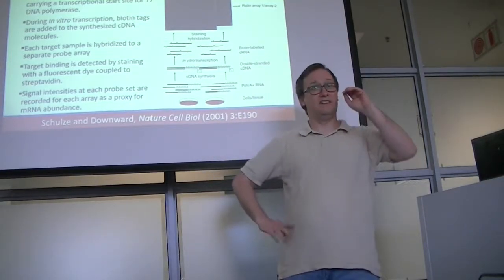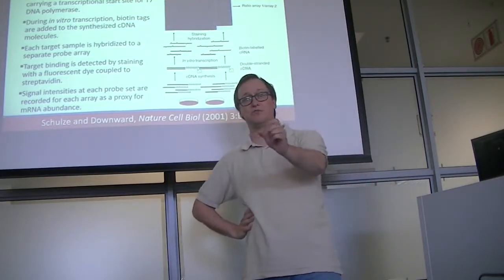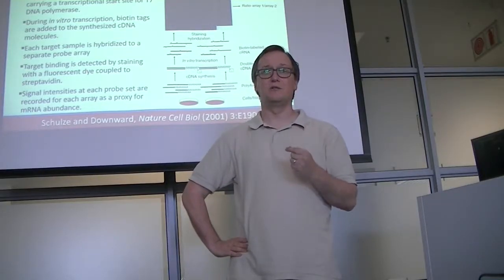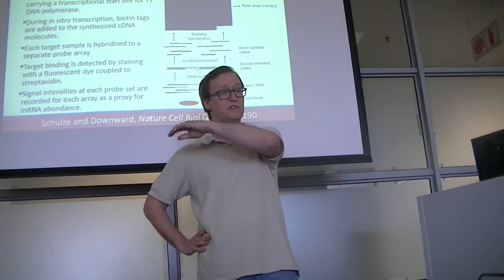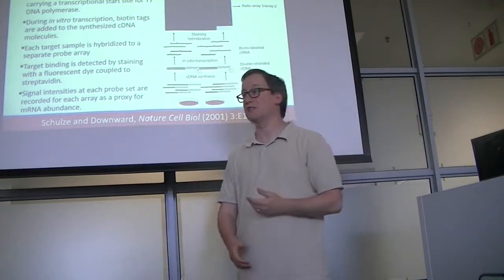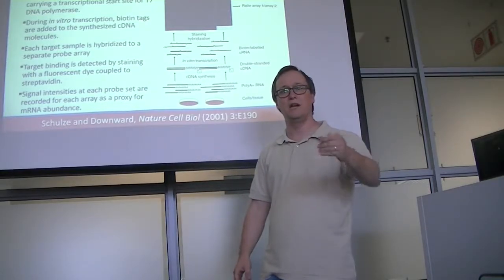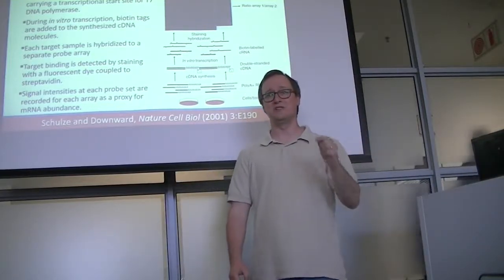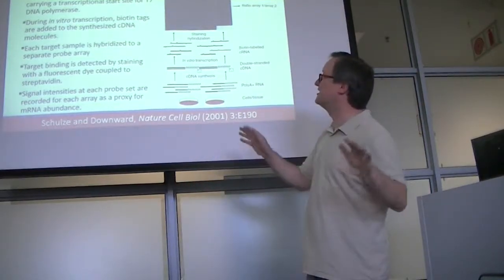Okay, now in today's methods, we don't typically combine two different samples on an individual microarray. Part of the reason for this is that frequently microarrays get used for experiments with a really large N, meaning that we have hundreds of patients that we want to profile for their RNA content. As a result, it's a lot more straightforward for us if we can use each microarray on just one sample. It's also coincidentally very beneficial to microarray manufacturers who get to sell you one microarray for every sample you're going to do rather than letting you combine them. But that's neither here nor there.